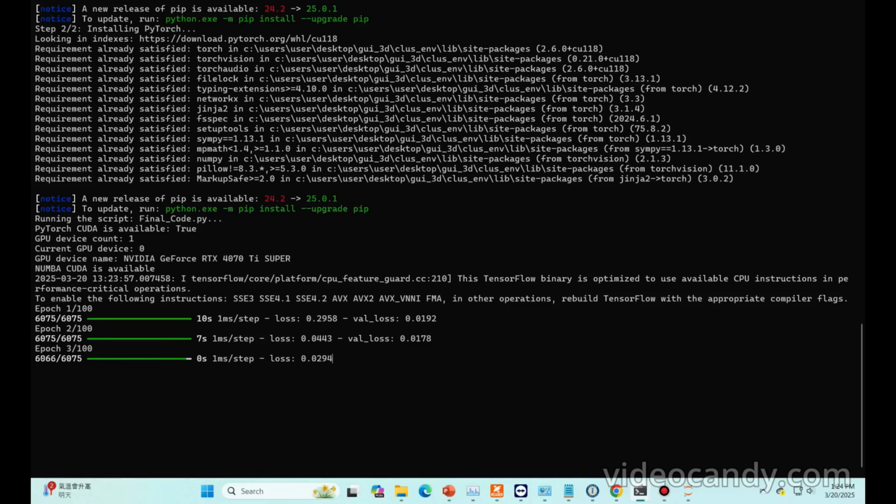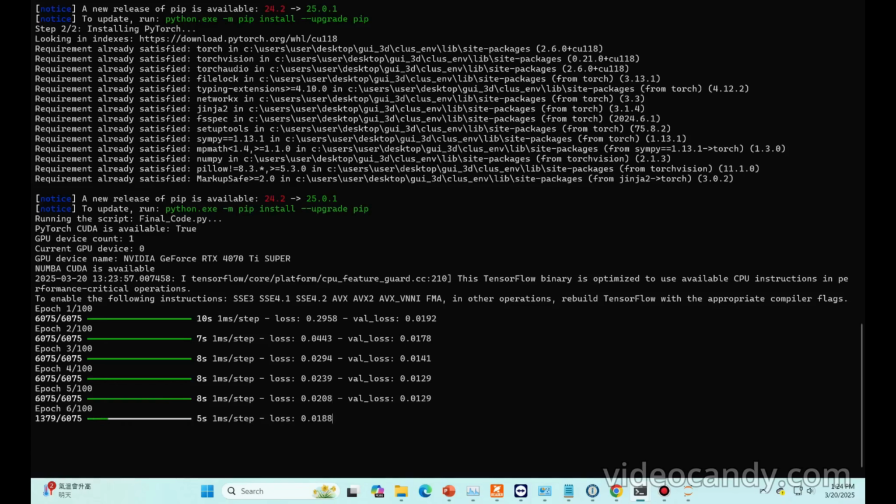So this is a user friendly app based on Python, and you can see that the results are based on sequential analysis, and the output is in imaging form, like you see the different images of the clustering. The time span and the time steps for the memory are already managed, and also depend on the power of the GPU, like this is RTX 4070, some are 4060, so yeah, it varies.